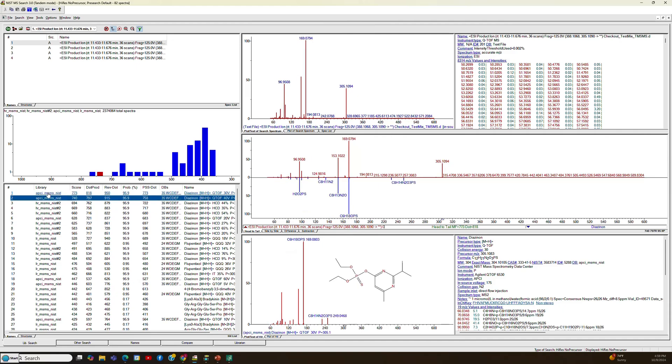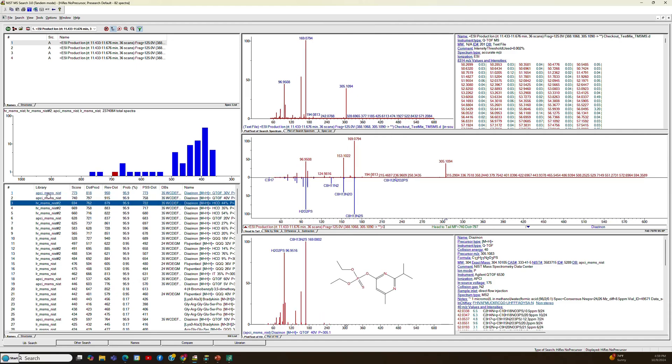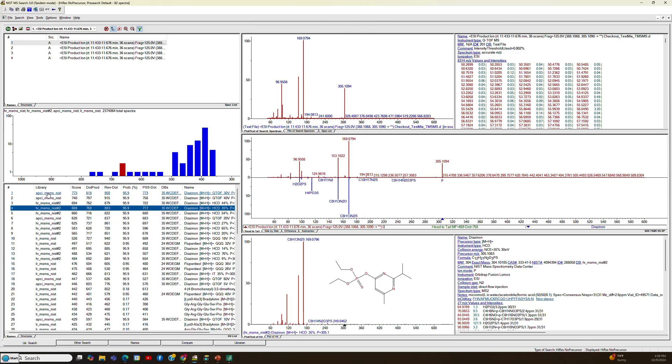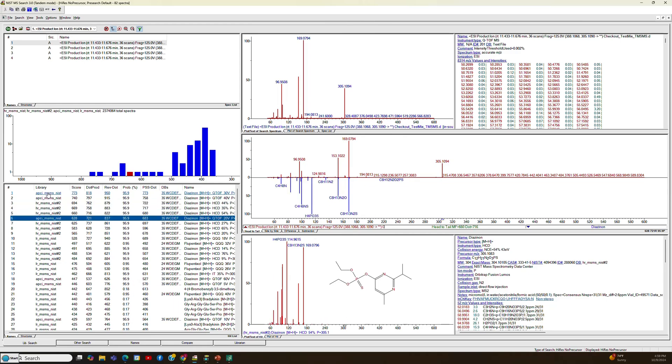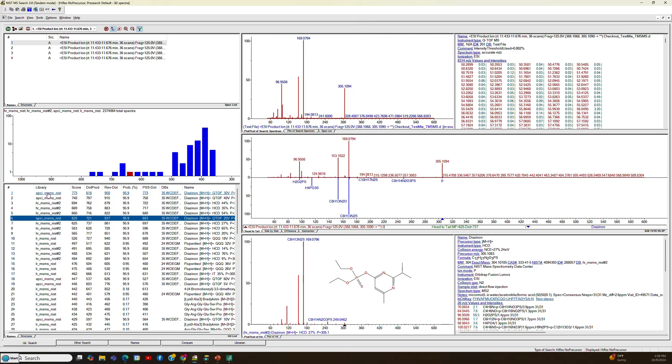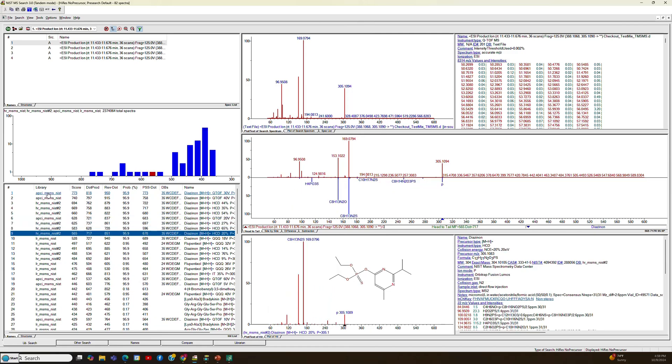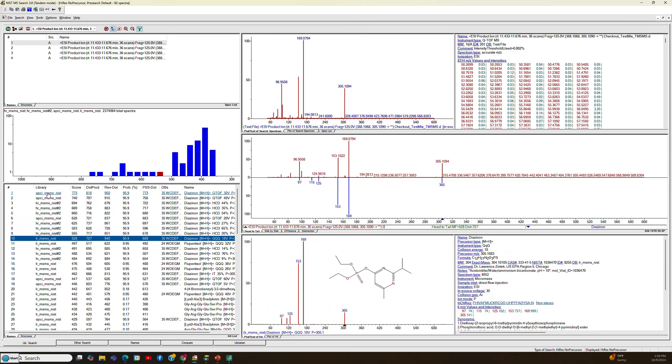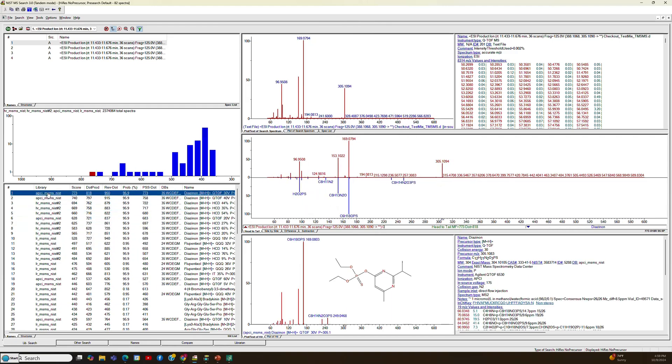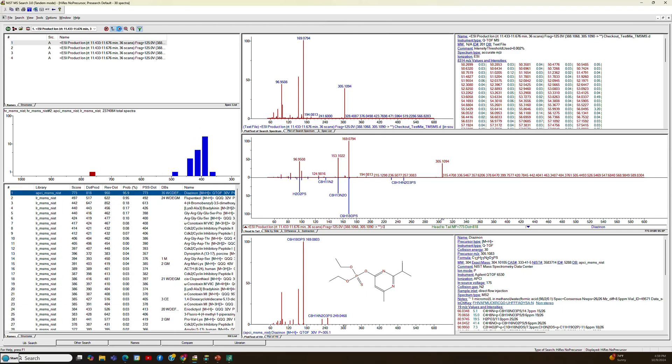But you can see it's the same compound over and over again, actually, from different libraries, different spectra, different energies. I think there's a bunch of them. So if you wanted to just see different compounds, then you have to go up to the top and say, Best Matching Only. What that does is it gets rid of things with the same CAS number. So when you step through them, you won't have as many duplicates to look at.